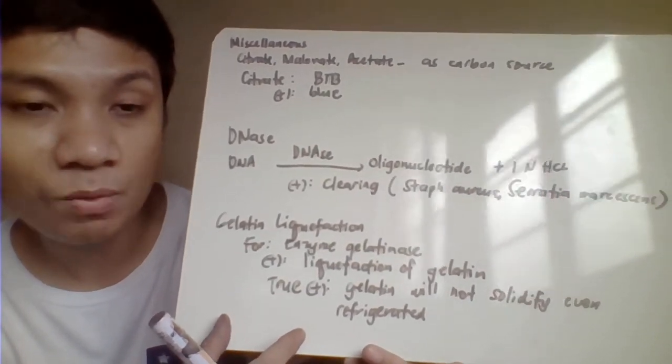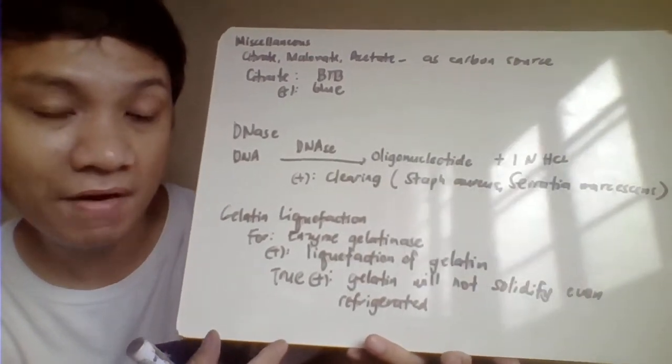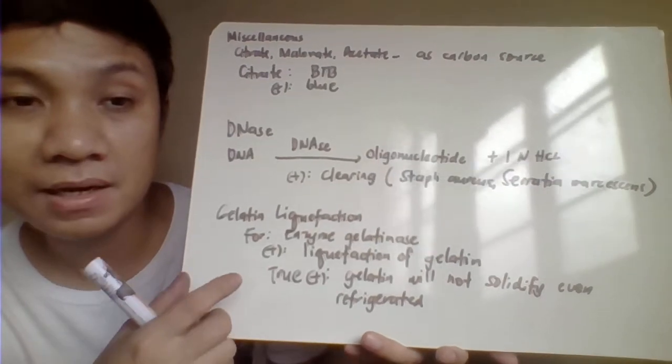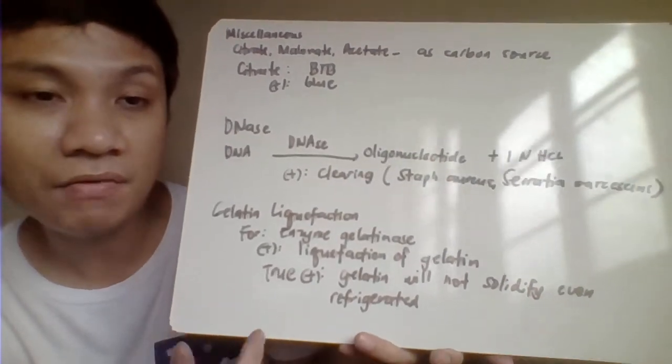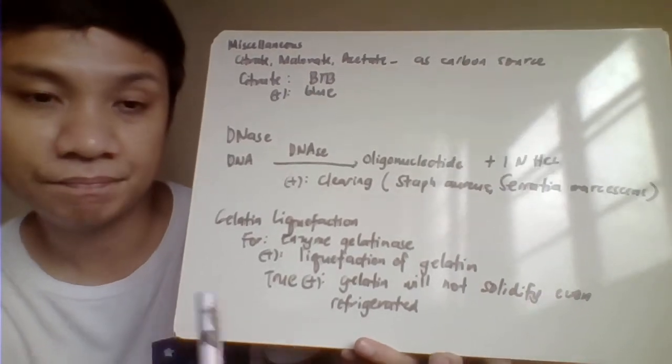If you refrigerate that one and it does not solidify, it's a true liquefaction because of the enzyme gelatinase. However, if it solidifies again upon refrigeration, meaning to say that one is not a true liquefaction.